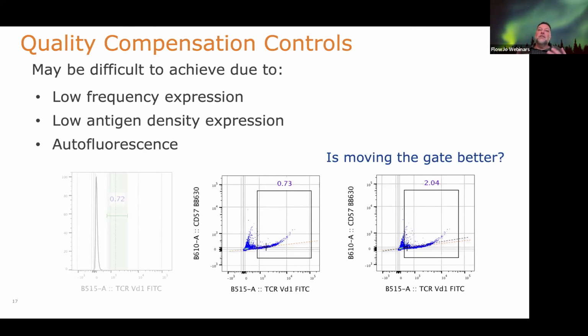And so I'm not aware of that challenge with compensation beads. There are many different bead manufacturers. Maybe there is a good solution there for binding those antibodies. There are different beads, like rat hamster beads are different from the anti-mouse beads. So you've got to look at where your antibody comes from and get the appropriate bead for the antibody that you're using, right? But that is a very good question. Thank you for posing it.